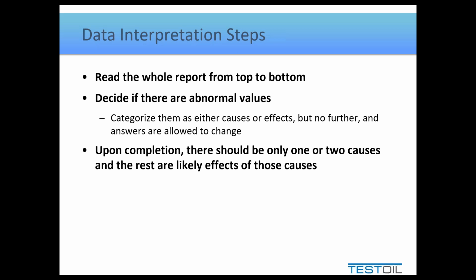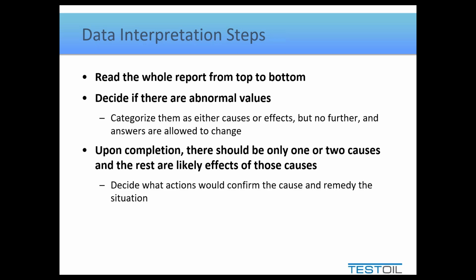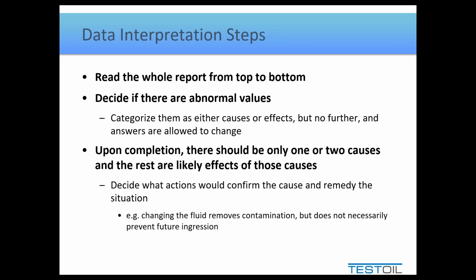What we then will do is decide on the next corrective action, or maybe we can identify what went wrong in the situation. When you're thinking about what to do next, I will caution you on this, and this doesn't apply to today's example, but I will caution you that changing the oil is almost never the solution. So many times with other examples I go through, people send me a report and say, what do you think of this one? Should I change the oil?